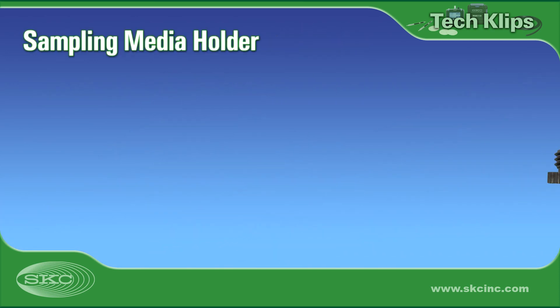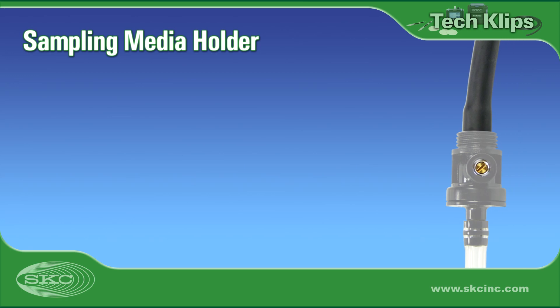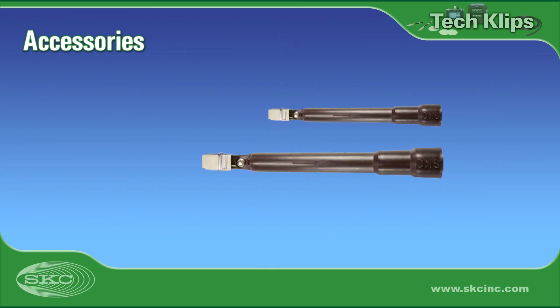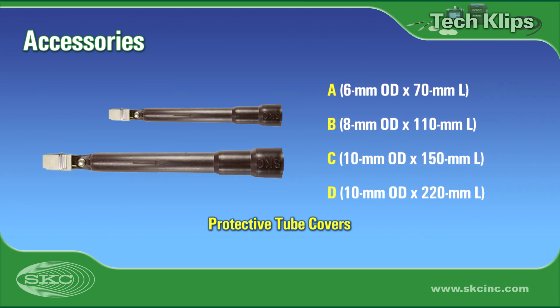Select a non-adjustable tube holder to connect the sorbent tube securely to the low-flow sample pump inlet. For higher flow pumps, use a low-flow adapter kit that includes an adjustable tube holder with CPC, such as the SKC All-in-One. This will allow you to sample low flows in the range of 5 to 500 milliliters a minute.